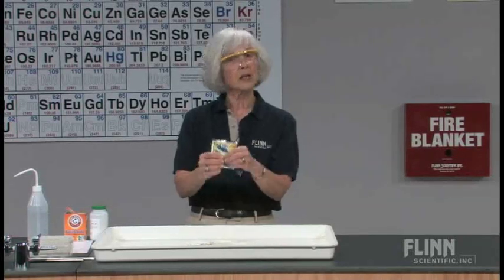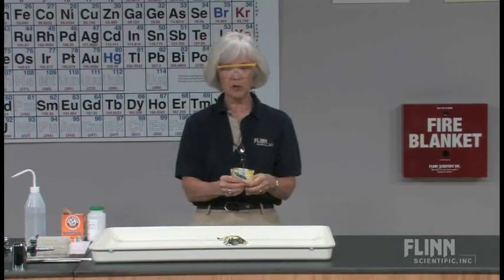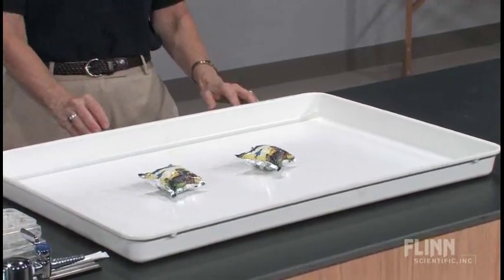Now, for today, we're going to do this on top of the demonstration tray. With my students, I would have them activate it and stand around at various sinks in the room in small groups and actually observe it there. But we'll do it right now so that you can see. The directions are squeeze it up. We'll do a couple of them. And then I will stand back.